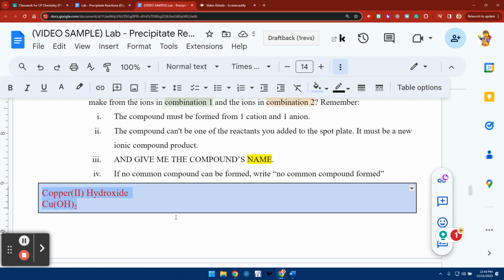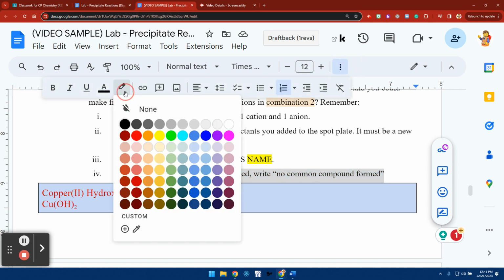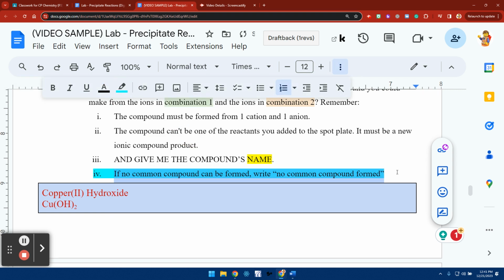So you need to do this for the 3 different pairs of ionic compounds that produced similar looking results in your experiment. Now listen, Mr. Gucci is a bit of a jerk. I will freely admit it. I do it because life is hard. And I want to prepare you for the fact that sometimes in life, there's no easy answers. And so, for the 4 matching combinations that your testing produced, one of them does not have a compound in common. The two compounds merely look similar, but they are in fact not made of the same stuff.